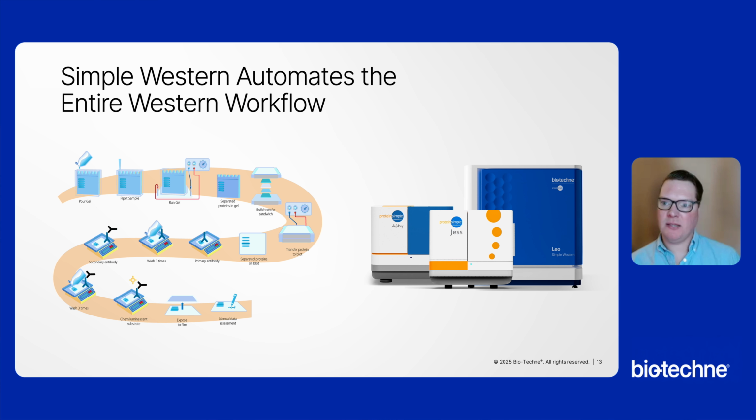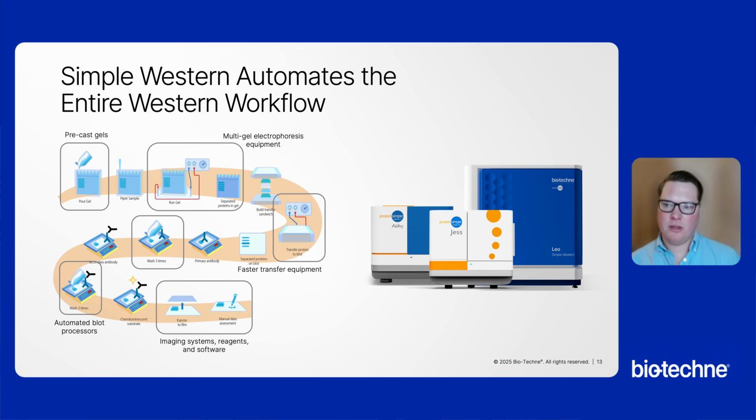As we know, there are many steps to a Western blot, and you may even be familiar with or using products to make parts of the workflow slightly easier or better. This includes using precast gels, higher throughput electrophoresis chambers, faster transfer equipment, automated Western blot processors, or advanced imaging systems. These individual tools, or the combination of them in series, is sometimes marketed as automated Western blotting. But when you think of it, you still need to carry out each step.